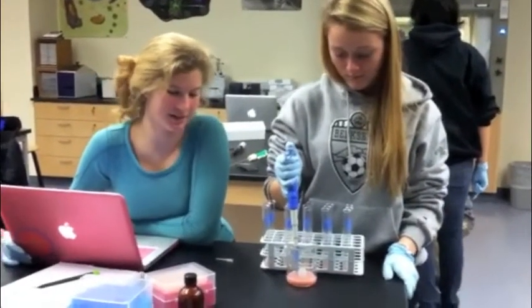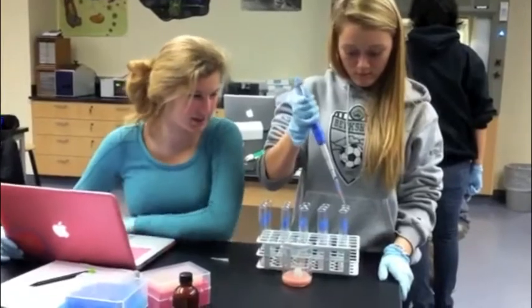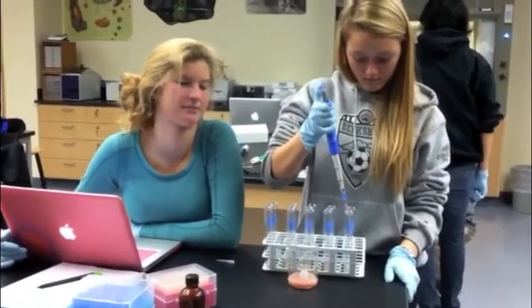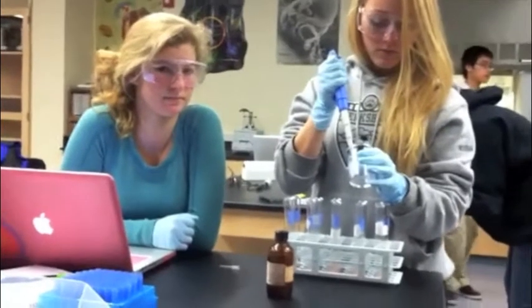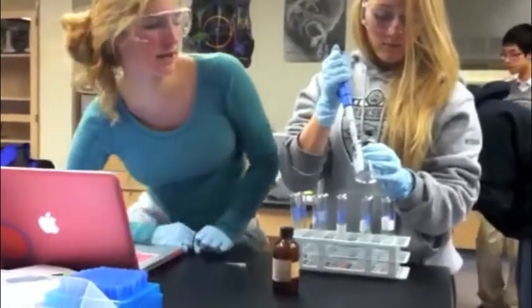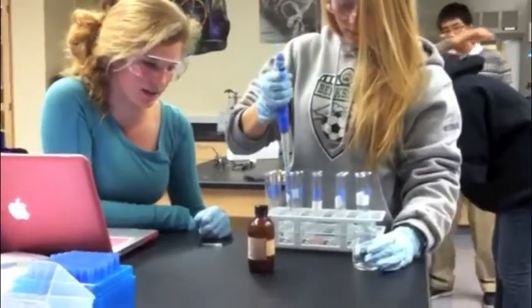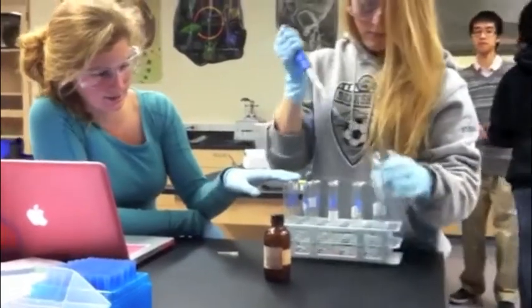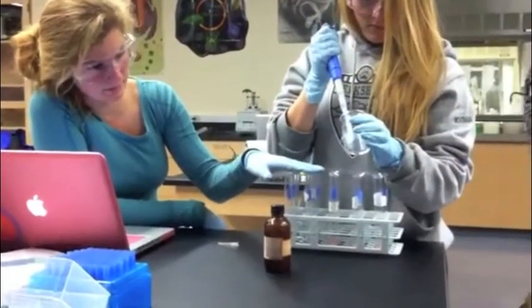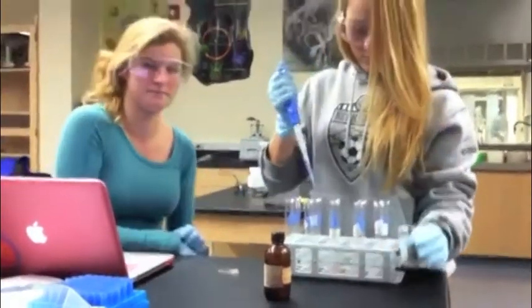We're adding one milliliter of catalase to 15 test tubes. We're putting silver nitrate in different concentrations into each of the tests: this set has zero, this has 0.1 milliliters, this is 0.2, 0.3, and 0.4.